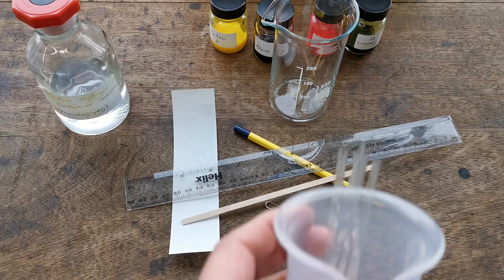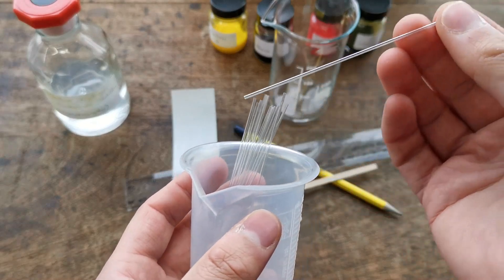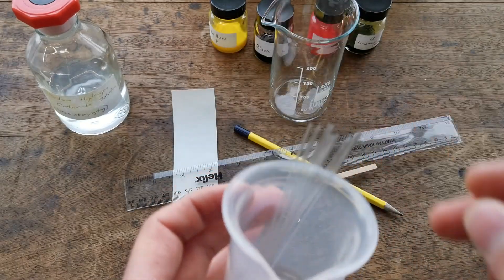We're also going to need some capillary tubes. These are just very thin tubes of glass that are used to put dots of ink on the chromatography paper.